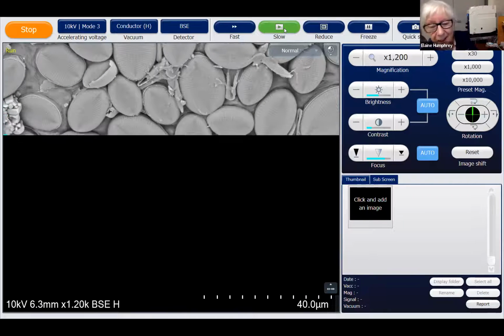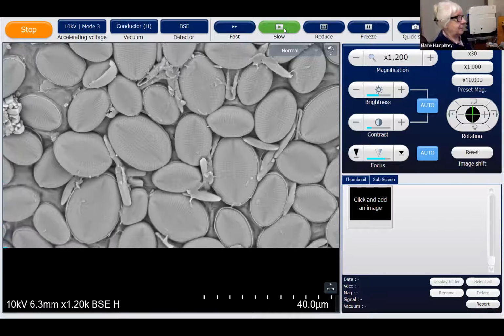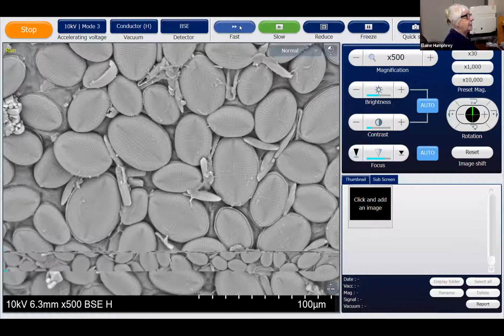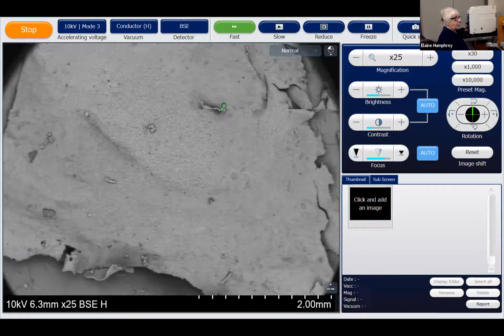So diatoms are single cells. If you go to the ocean and you see a greeny, orangey, browny bloom, it's usually diatoms. And these ones, well, we ask the kids, what do they remind you of? And the kids say cocoa beans, which is great because the scientific name of this group is Cocconeis. And you're going to hear Cocconeis a lot, but it's a single cell with a silica coat, and silica is what we use to make glass. So this is a plant that lives in its own glass house. And there are a few other species here in between these Cocconeis. There are a few other animals on here, on this top end.